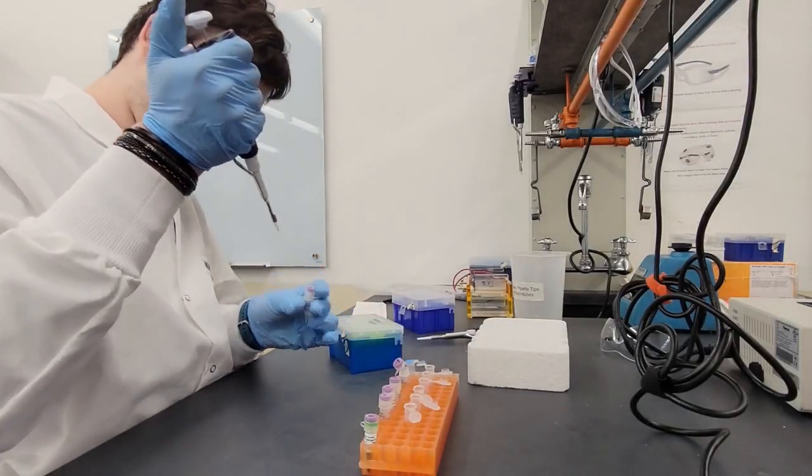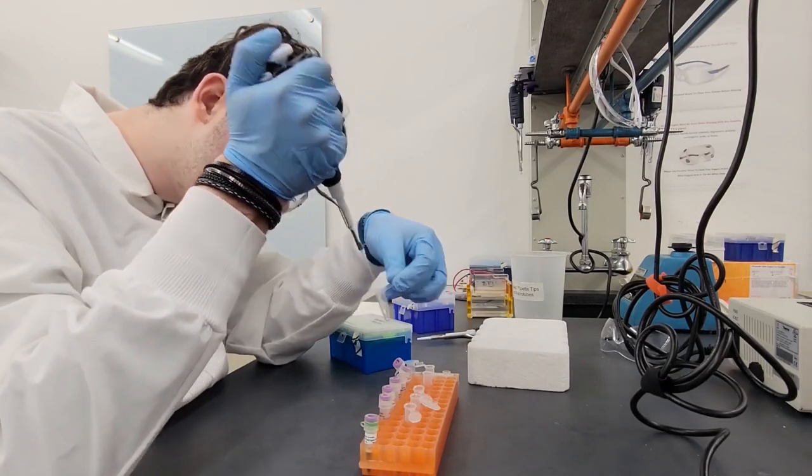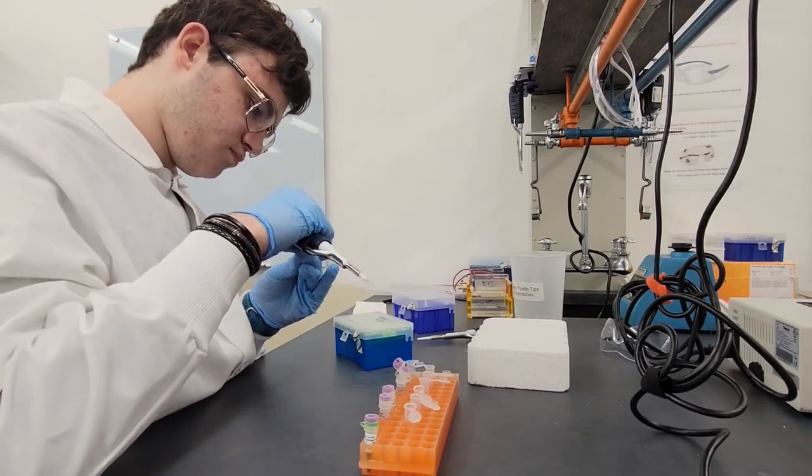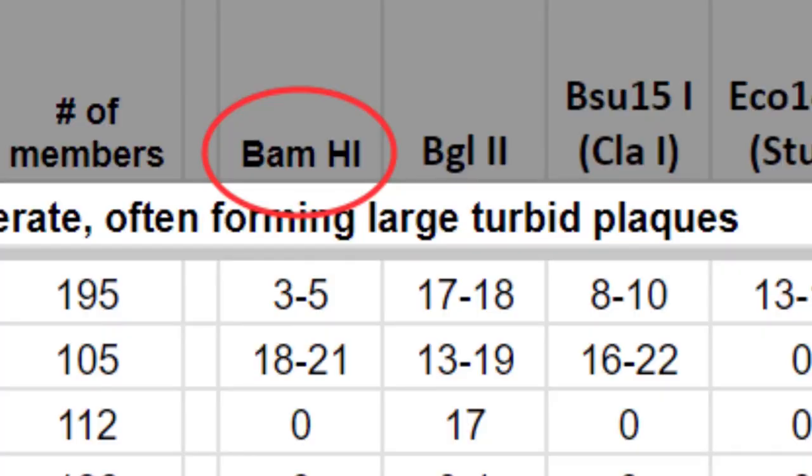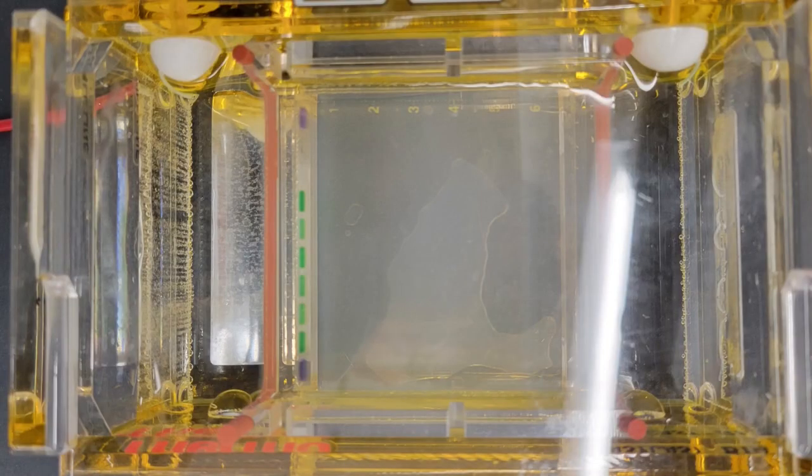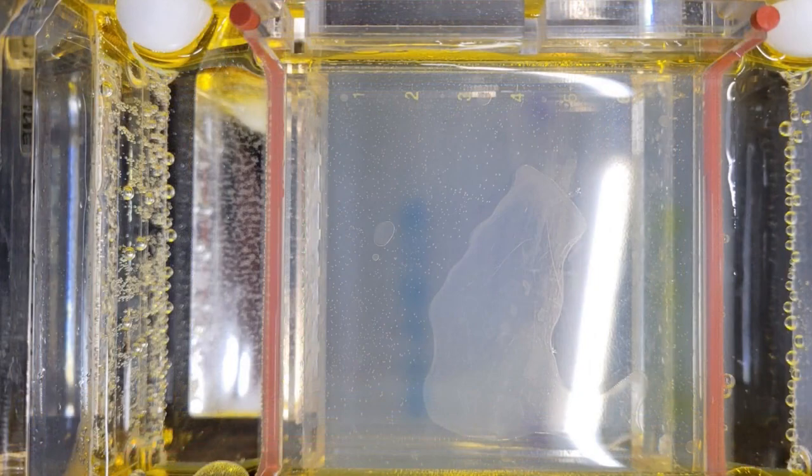But Michael, you only really have one DNA sample. What's the point of piping so many things? We're going to add something called restriction enzymes, and these are stuff that cut up the DNA. And because we know exactly where they cut, we can get an understanding of kind of what type of phage it is because different types of phage react differently to different restriction enzymes. So for instance, if you only get cut by one of this specific type, well, then you know that you're probably going to be a B type. But if you get cut maybe 15 times, you're going to be a C type. We also have to add dye so we can actually see what we're piping. And we're going to run this through for about 30 minutes. And because it has a different polarity of current on each side, it's actually going to slowly move through the gel and give us an understanding of concentration.